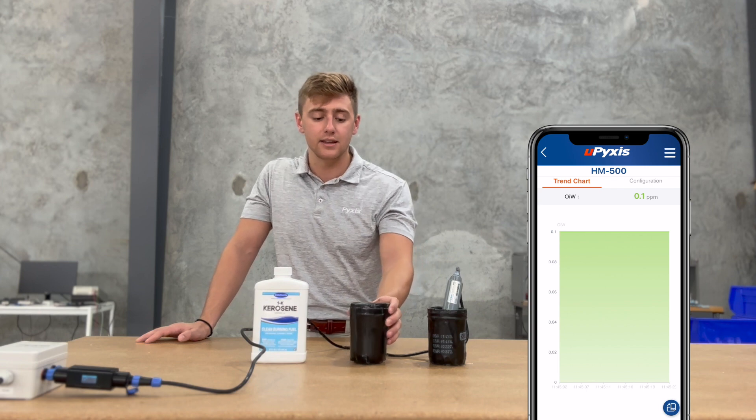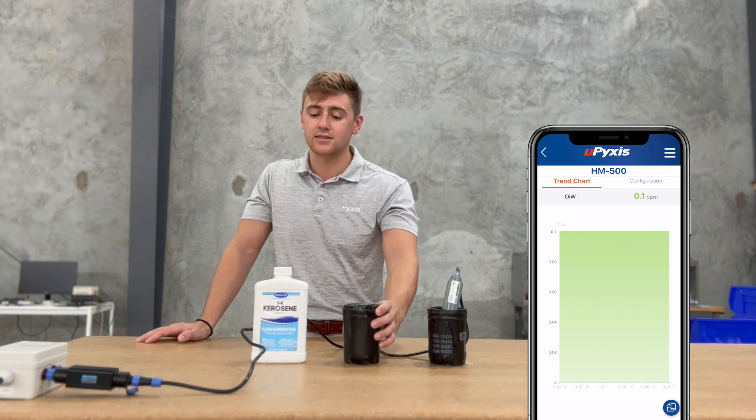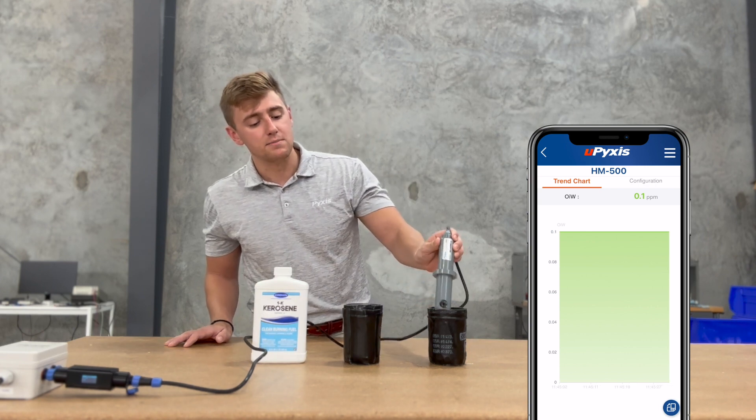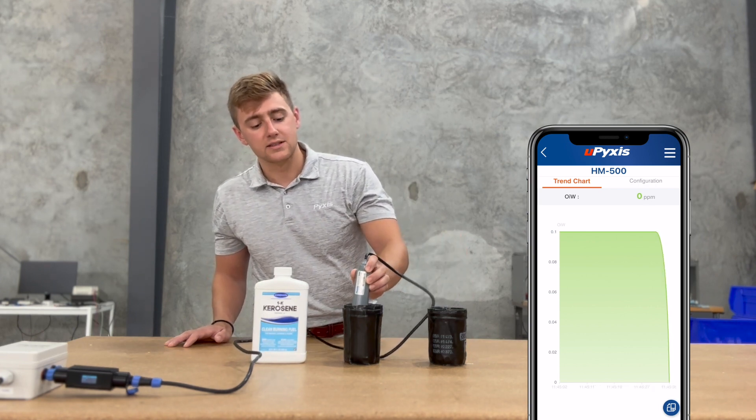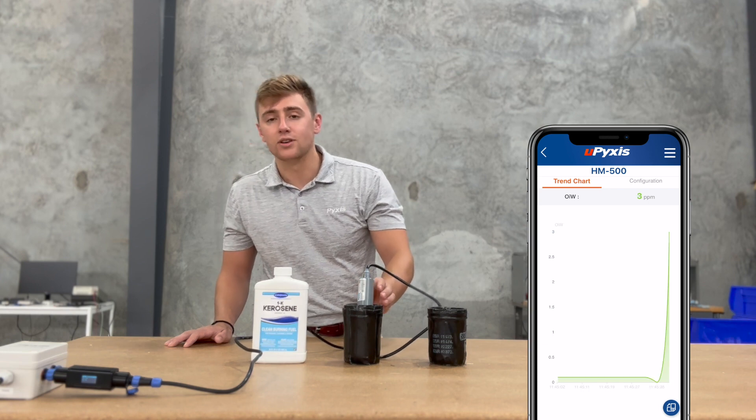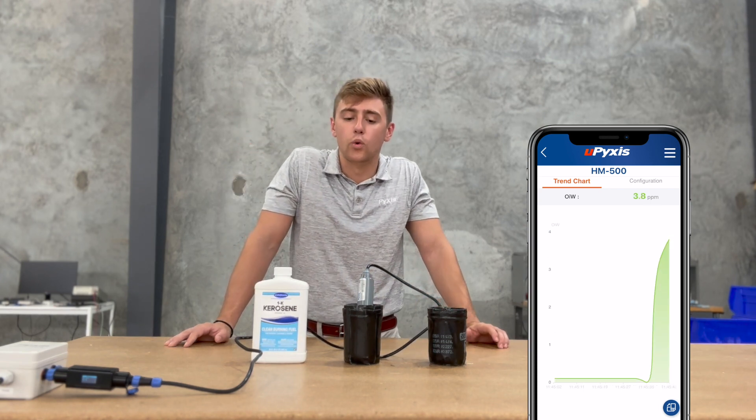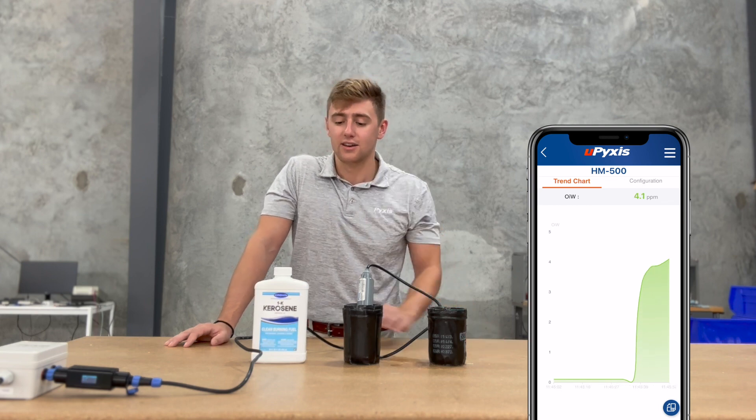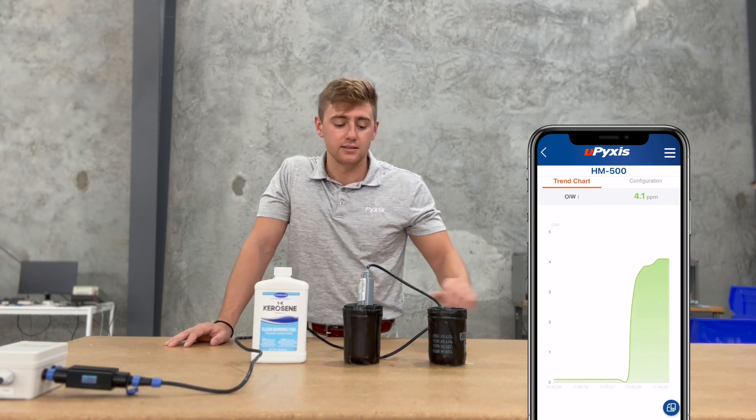And then I created a little solution here that has a little bit of kerosene and tap water to give us roughly about 5 ppm. So we're going to swap the sensor over. And on Pixis you can see that it's reading right around 4 to 5 ppm based on what we thought the concentrate would be creating it with tap water and kerosene.